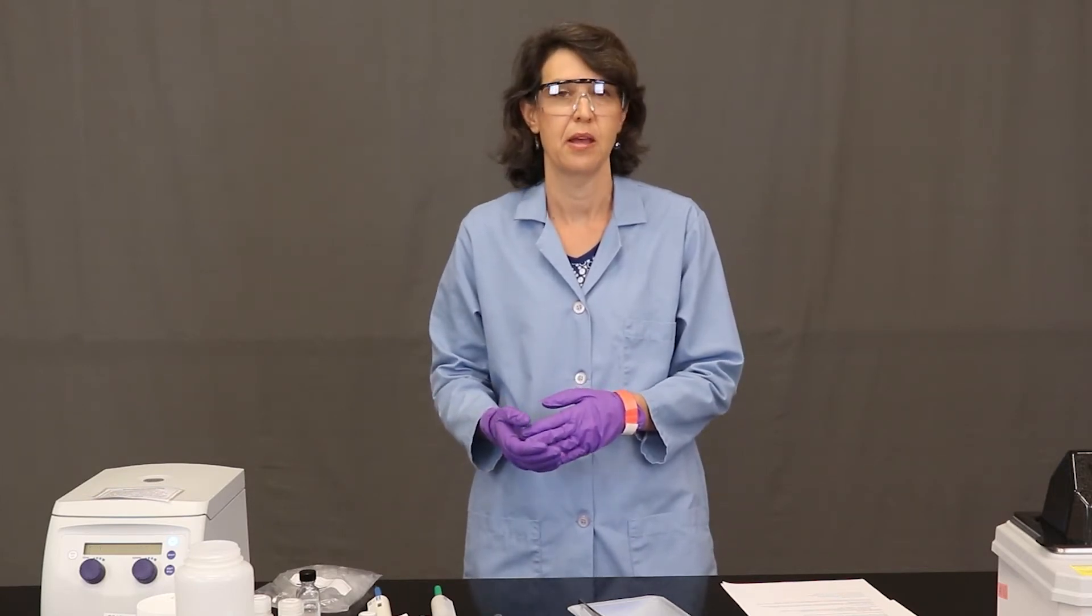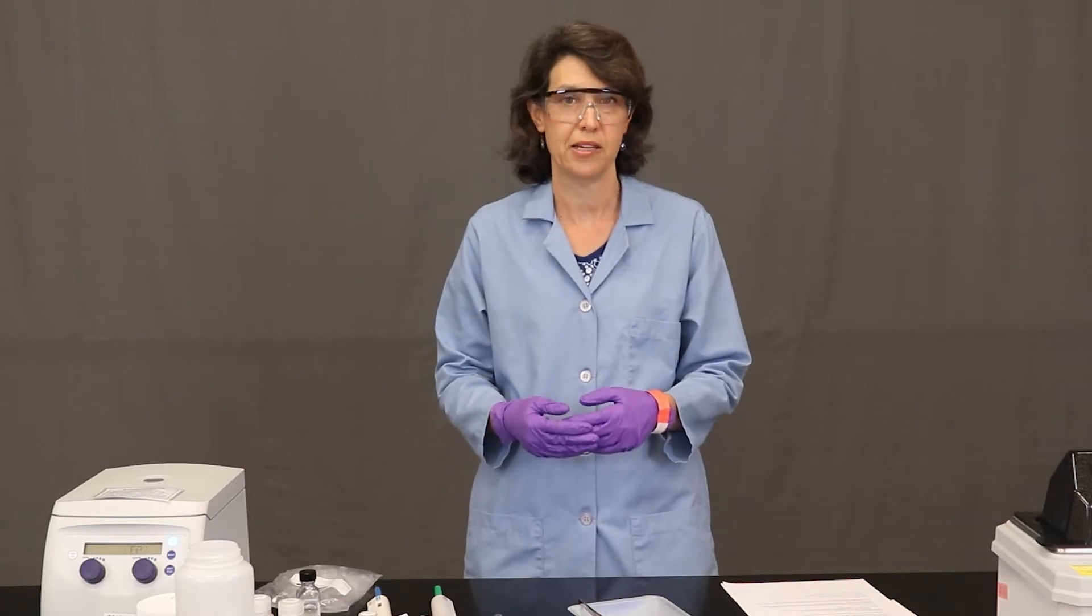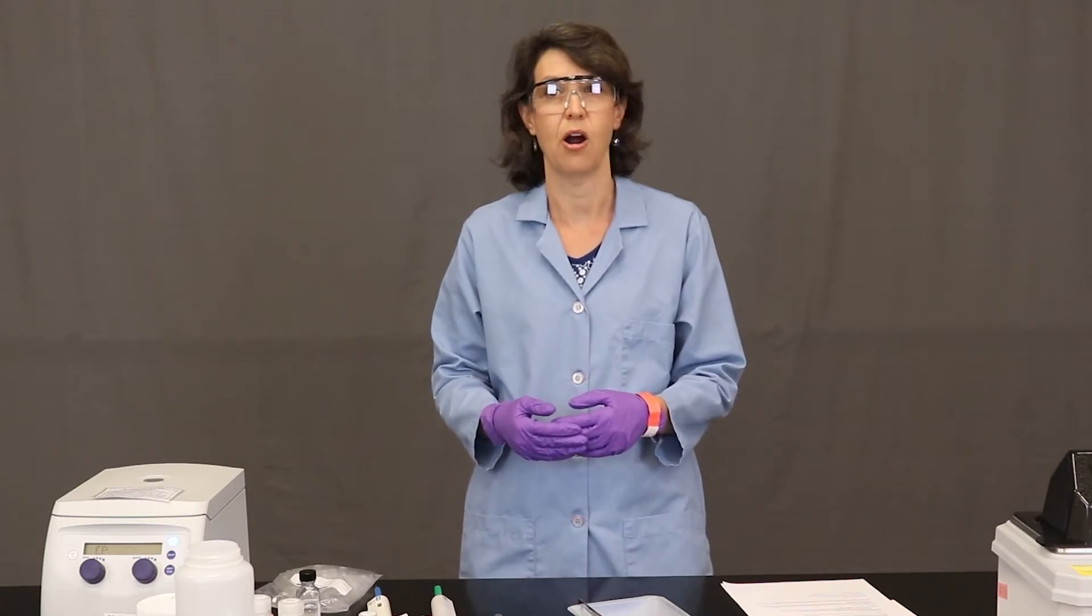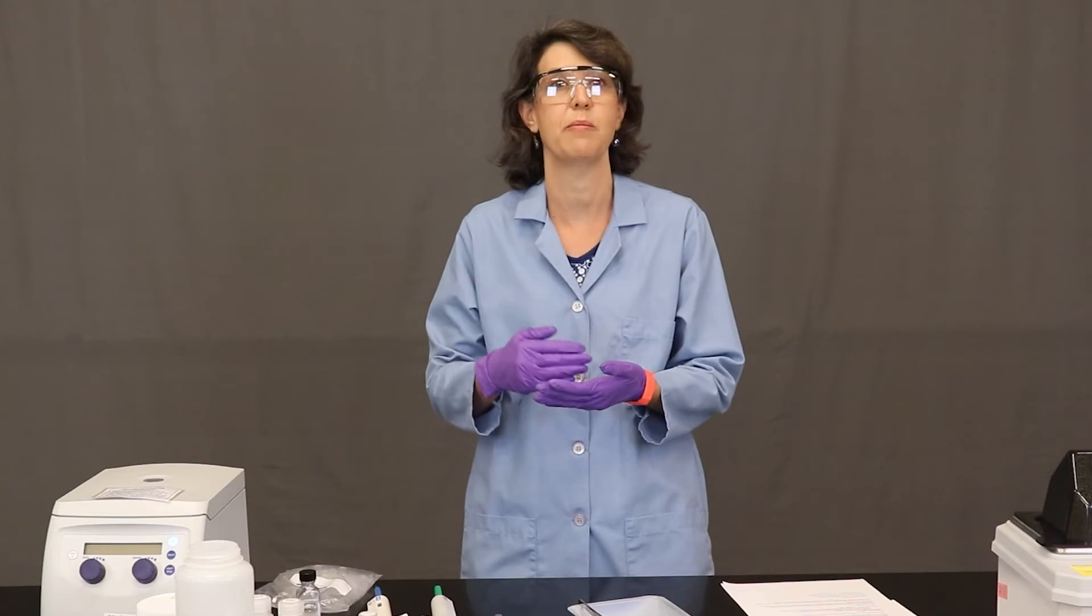So the wet lab activities that we're going to do are basically divided into three main parts.